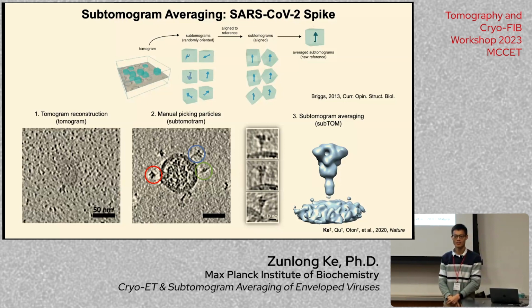And then the biological question was, does the HIV capsid migrate through the nuclear pore complex? This has been shown at Max Planck, I believe. Does the capsid migrate to the nuclear pore complex?